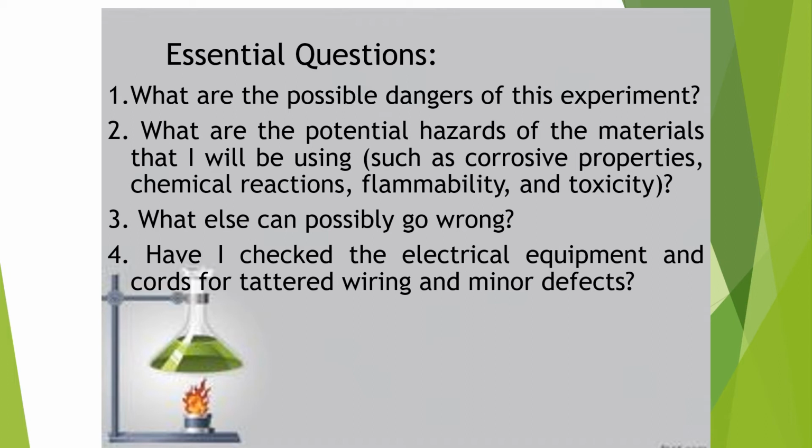It is also very important that the teacher gives a pre-lab discussion. During the pre-lab discussion, she or he will give a copy of the lab sheet and present and discuss it to the class. So the students will ask themselves, what else can possibly go wrong?